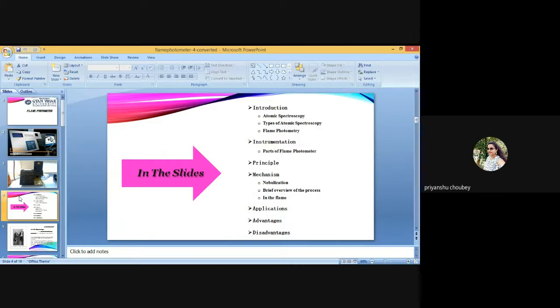Each excited individual atom emits one quantum of radiation when it returns to the ground state. Therefore, the increase in the intensity of radiation emitted from the non-luminous flame will be proportional to the number of atoms of the particular element in the flame, that is, its concentration.